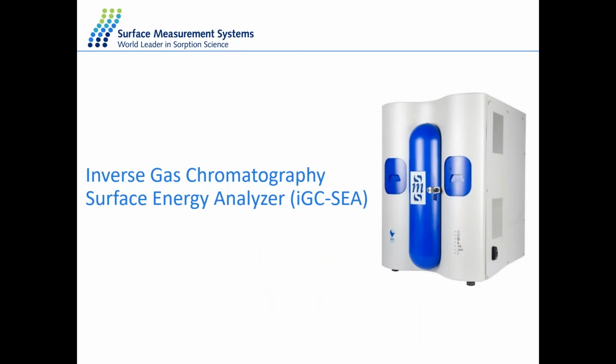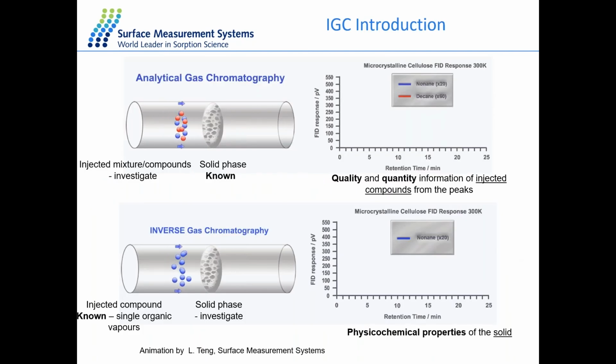And the next technique I'd like to introduce is inverse gas chromatography. Thomas and Florian already gave a really nice introduction to the theoretical background of IGC, so I'm not going into details. I will just focus on the method as well as the instrument we are using today.